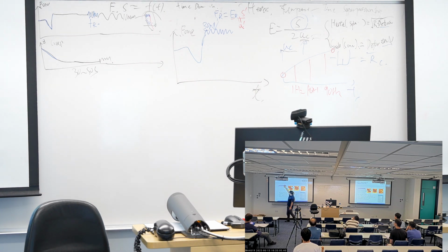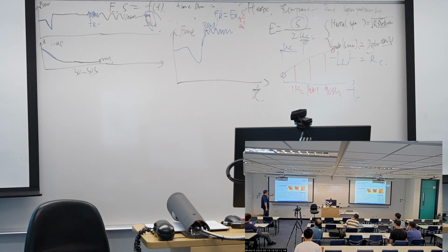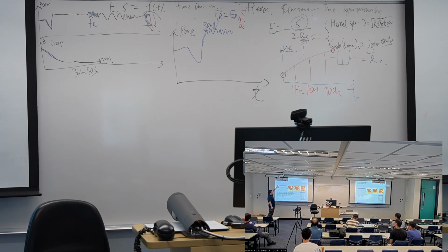And inside this hold, we will introduce this kind of modulation. And inside the modulation, of course, you need to define the modulation force and the modulation frequencies. And then we can generate a mapping of storage modulus, loss modulus, and the loss tangent on your defined frequencies.